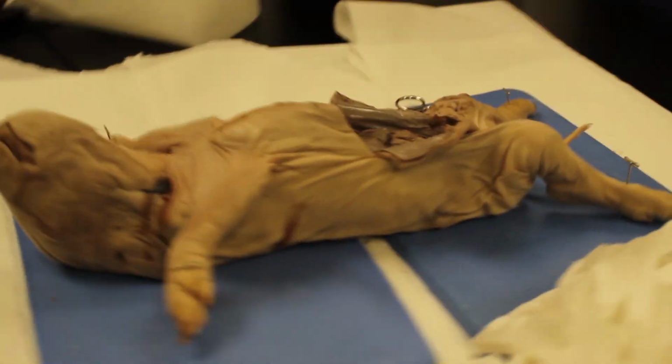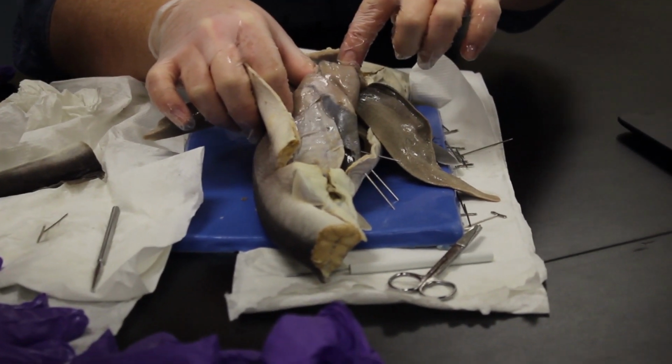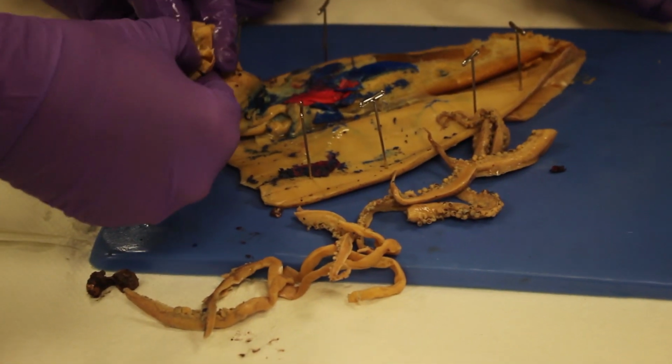and a pig. It's under here, then you become stomach, and then you're gonna morph into the intestines, and then finally out, they have a cloaca.